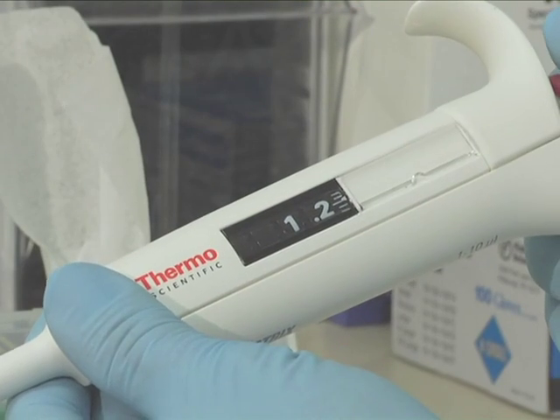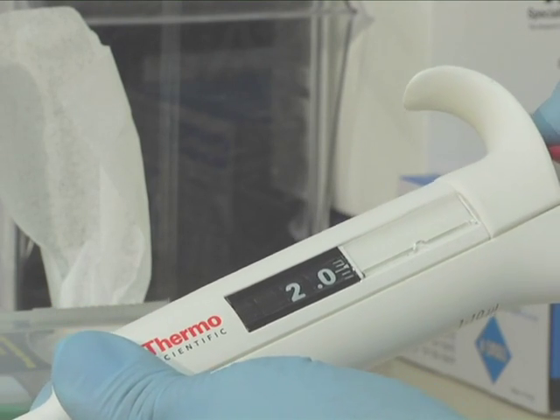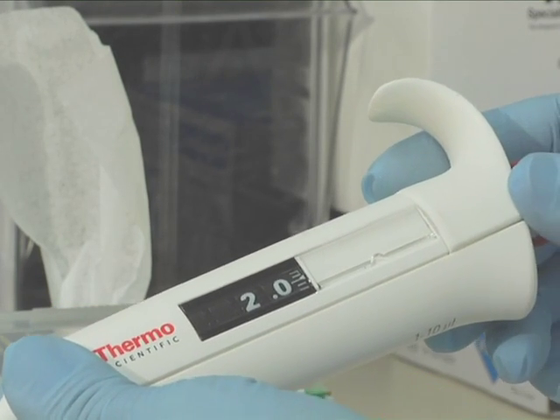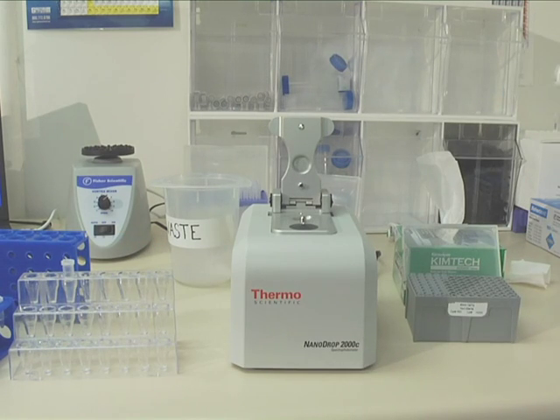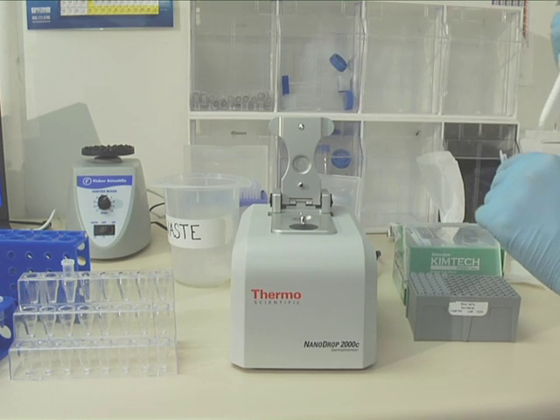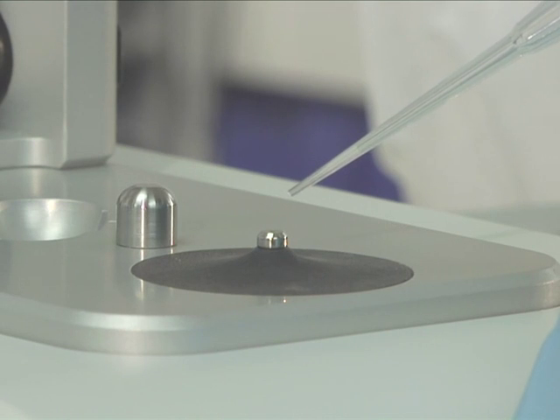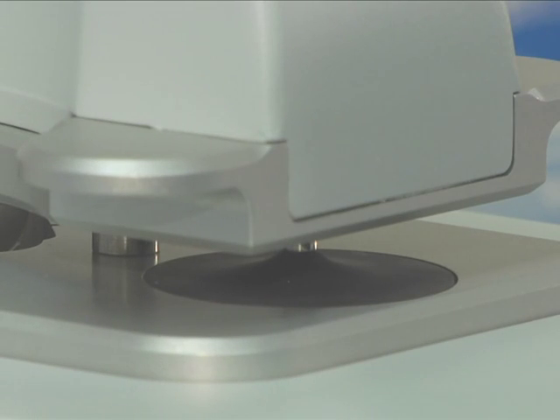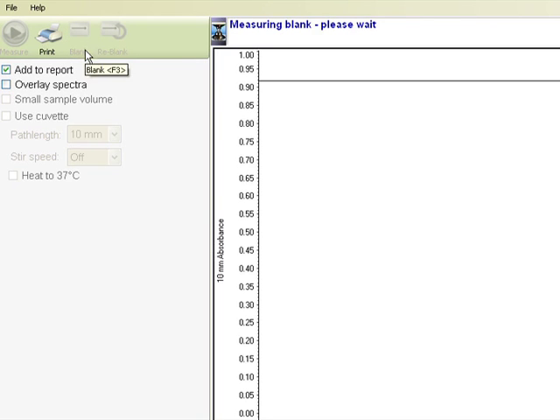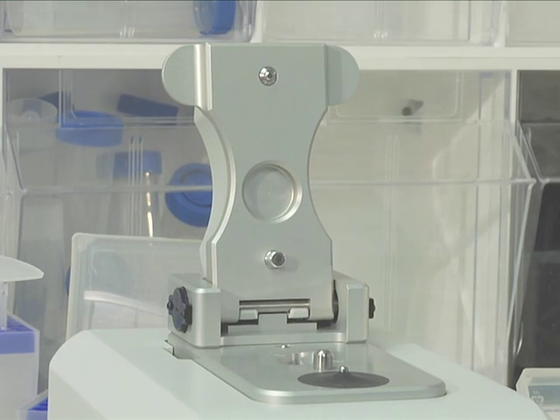Due to the variability in surface tension between different proteins, we recommend loading two microliters of sample to ensure proper column formation. To load, touch the low retention pipette tip to the bottom pedestal surface while expelling the solution to prevent the solution from adhering to the outside of the pipette tip. Expel less than the full amount of sample to prevent blowout and introduction of bubbles. Once the sample is loaded, lower the arm and click blank.